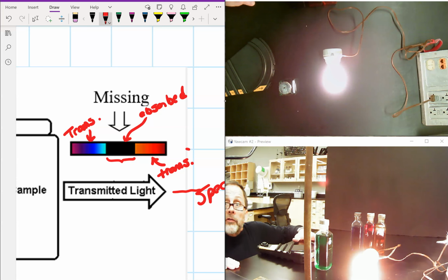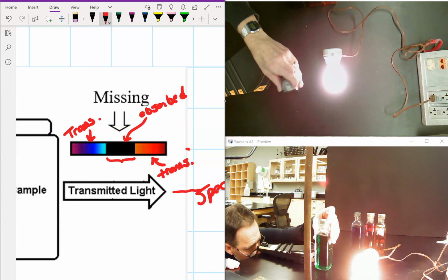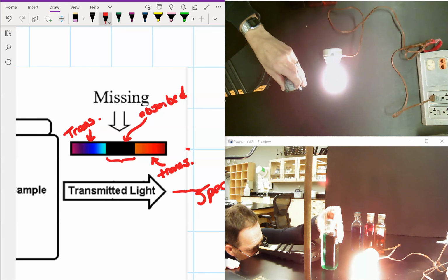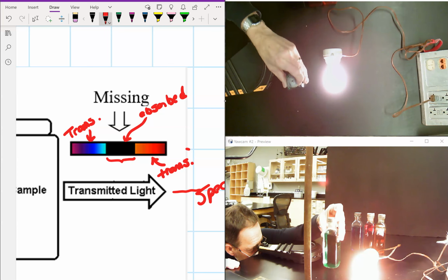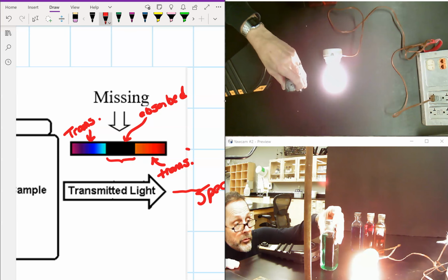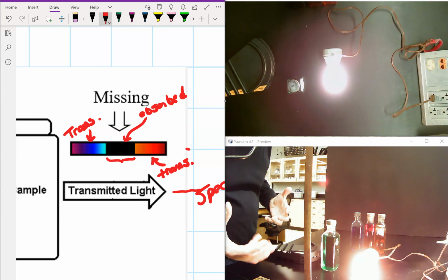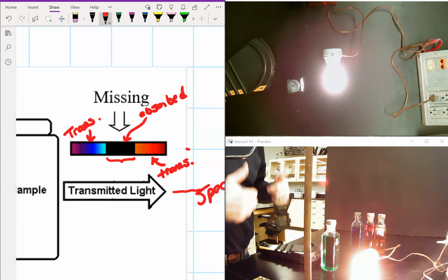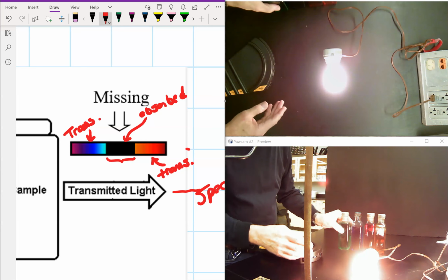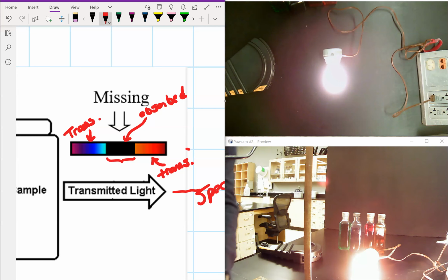One way that I find works quite well when you're doing this experiment is to look into the spectroscope and to remove the dye and then place the dye back in position again, back and forth, and you get a little light show as you'll see the continuous spectrum and then the absorption spectrum. It helps make things more clear what segments of the visible spectrum are being removed and what segments are being transmitted. Okay? Then you'd move on to another container and combinations as per the laboratory instructions.